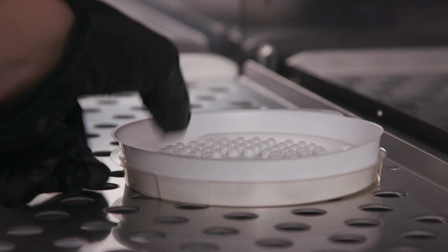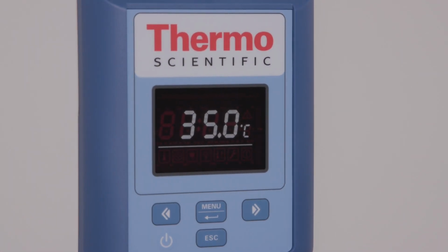After the incubation period, if there is a presence of bacteria, they will have metabolized the enzyme substrate, which will then fluoresce under UV light. Each well that fluoresces correlates to a most probable number of colony-forming units, or CFU. It's important to note that each method recovers bacteria differently.